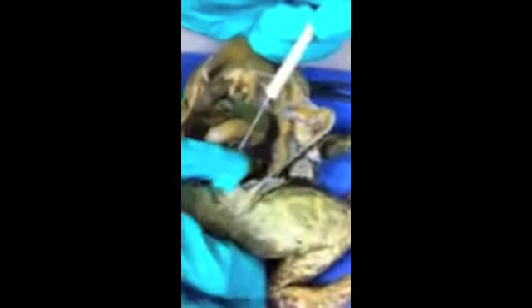And lastly is the rectum. The rectum, if you want here. The rectum is at the end of the large intestine. The large intestine is here, and the rectum leads out of the body.